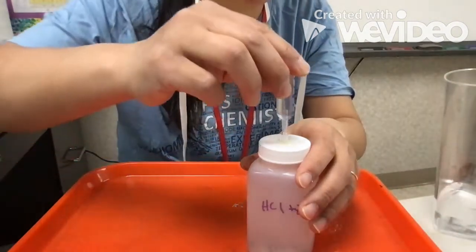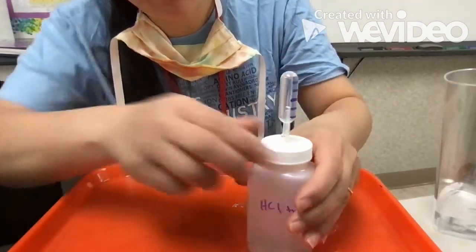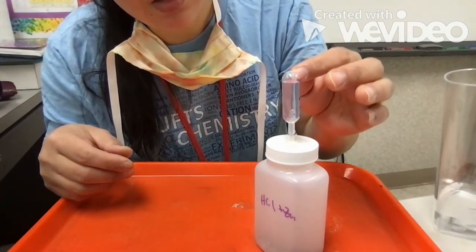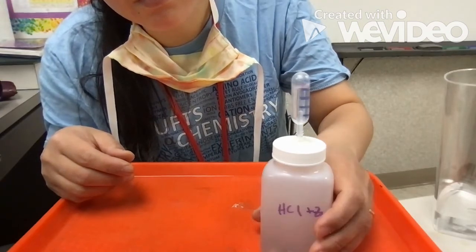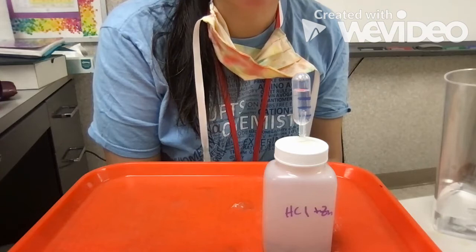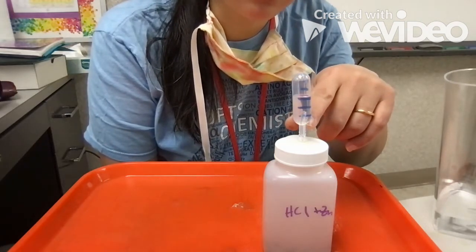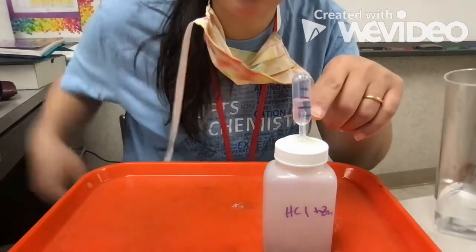So we're going to put this on here, and we're going to start collecting hydrogen gas, and you can see there's bubbles of hydrogen coming up here. Okay, it's going kind of slowly. And you can see as the gas goes into the rocket, it's displacing water, and water will come out. Okay, so what you'll do for the hydrogen rocket, you'll wait until you get down to the bottom there and the rocket's completely filled with hydrogen, and then I'll show you what to do in order to keep the gas in.